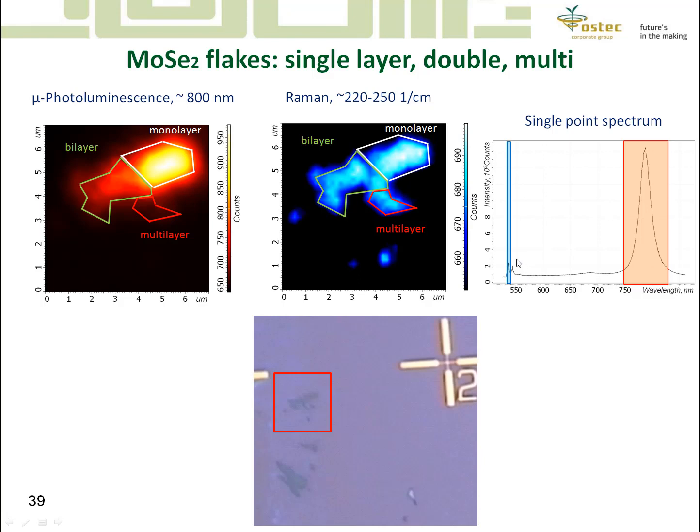You can see on the spectrum there are some relatively small peaks. On the left hand side there is a blue color band for detecting the presence of material, blue color peaks, and this image corresponds to the distribution of such peaks.